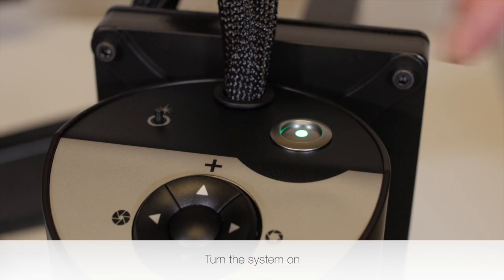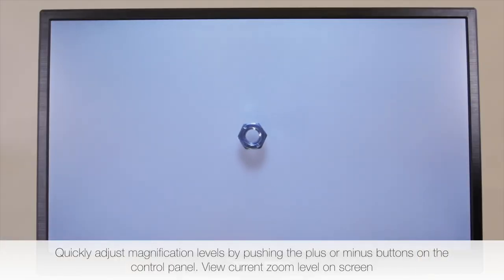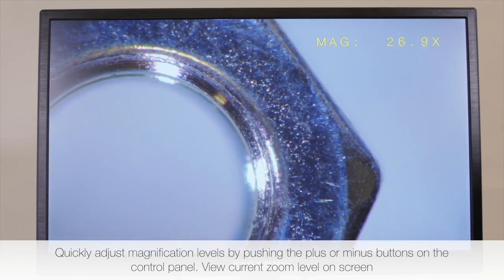Turn the system on. Quickly adjust magnification levels by pushing the plus or minus buttons on the control panel. View current zoom level on screen.